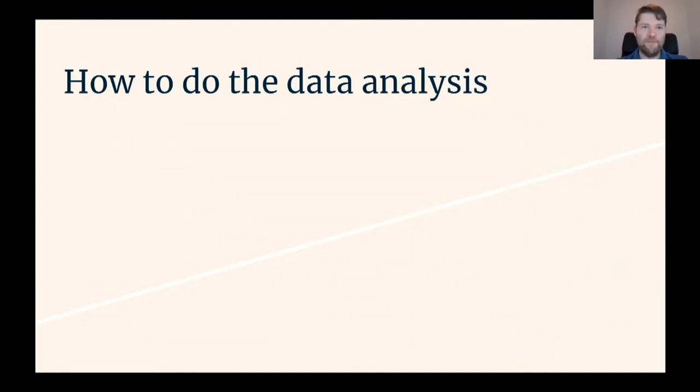So this leads us to the next thing, right? Because the Nanopore DNA sequencer that I've explained to you is almost nothing but a glorified ammeter. I mean, of course, there's a lot of tricky stuff, especially the biology-electronics combination there. That's highly non-trivial. But the only thing it produces is a squiggle. And the squiggle produced by the ammeter is not exactly what we wanted, right? We wanted the actual sequence of the A's, C's, T's, and G's. So this is, of course, where it turns into a software problem.